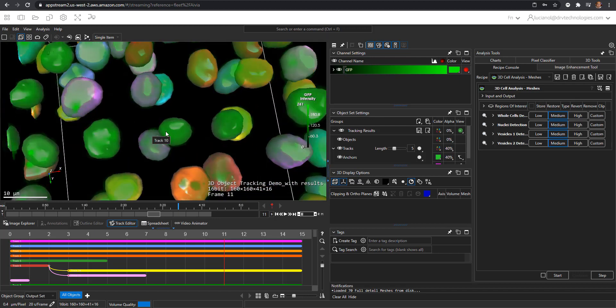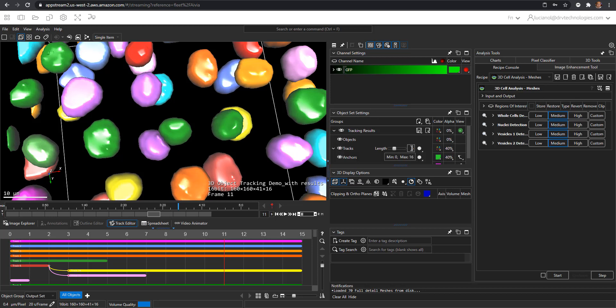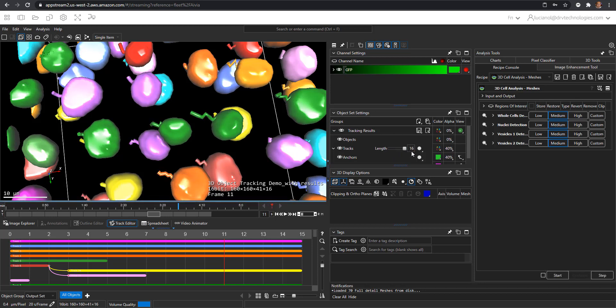There are quite a few display options for the tracks. Those can be adjusted under the object set settings, tracks. Right now they are not visible because I set them to 5 frames only. If you make them longer, more frames will be visible.